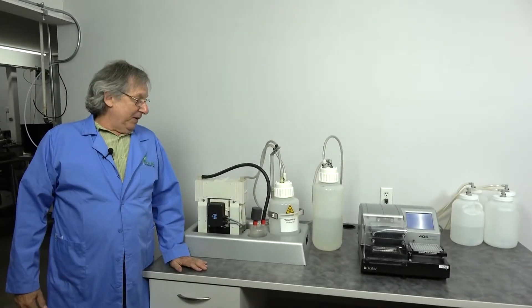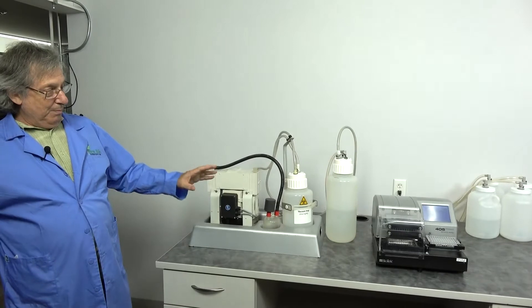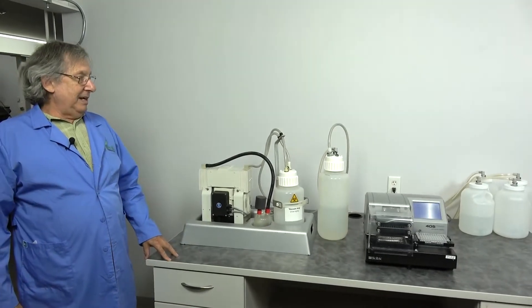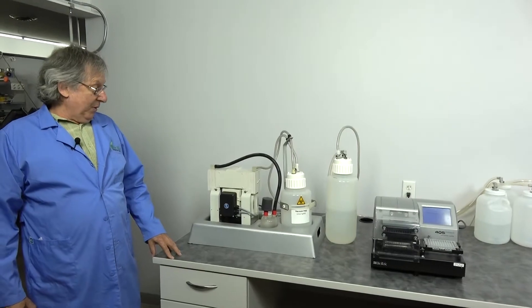Welcome to Life Scientific. We're at the tech shop. We're going to talk about the Biotech TS-405 plate washer with touchscreen.